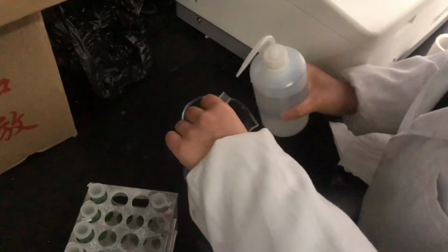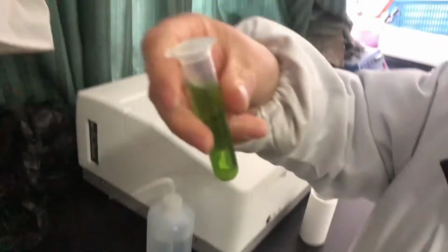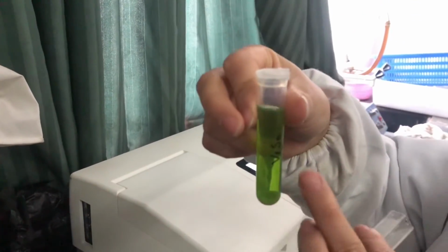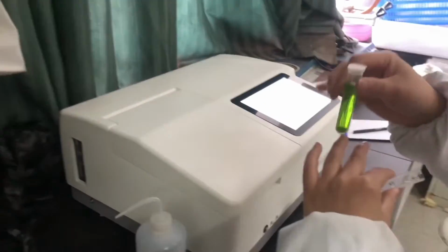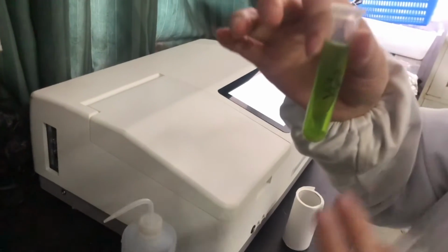Then wash. Every time we should wash this. Okay. And the last, we should know what sample we do. This we should write down or you take a photo. Okay.